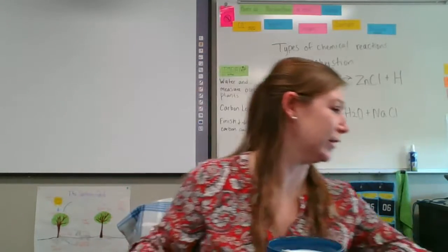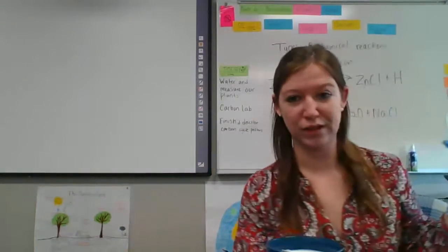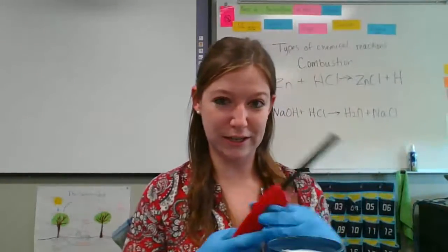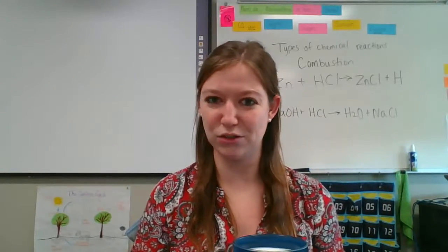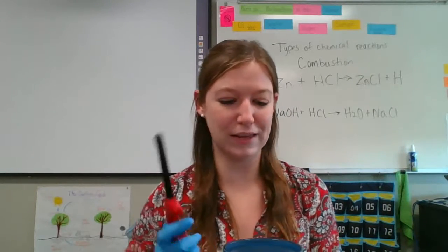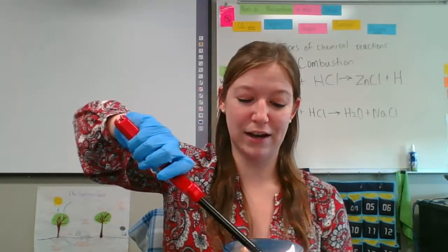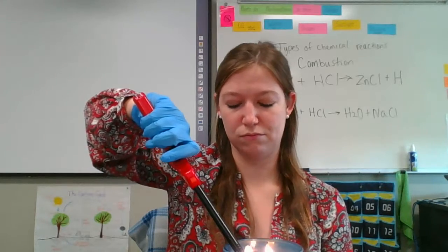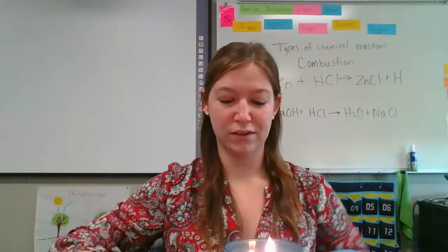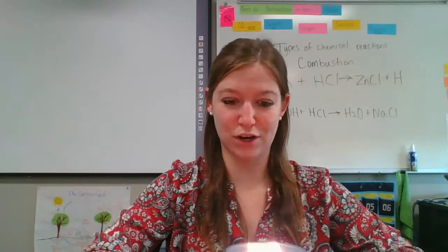Now for combustion, my ability to light the table on fire was largely unsuccessful, and I think it has something to do with the types of table surfaces we have in class, which is probably for the best. But if I just light this candle, okay, so here I have a candle that is lit. This is not product placement.